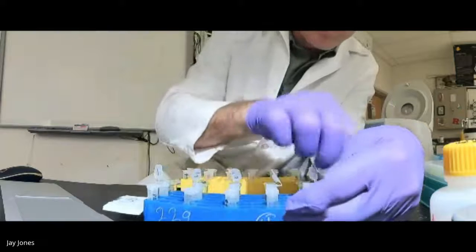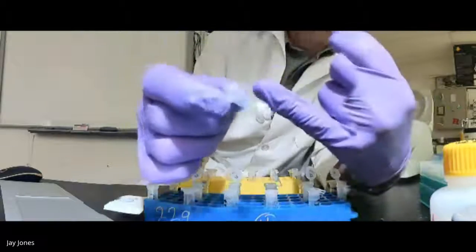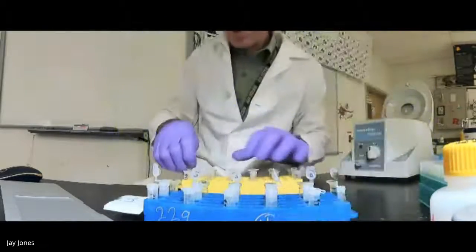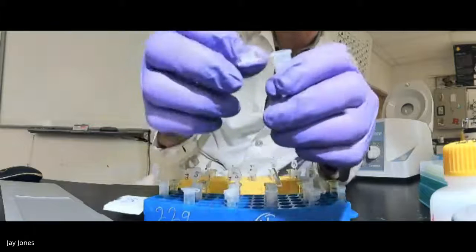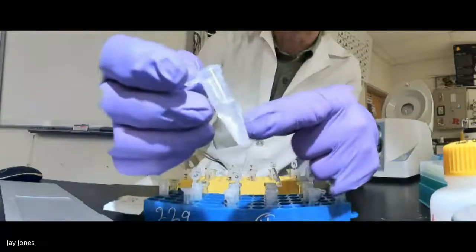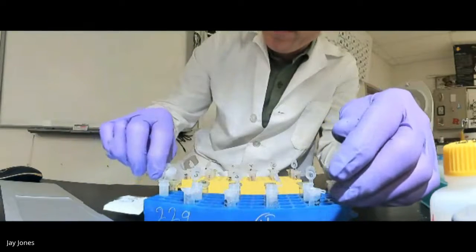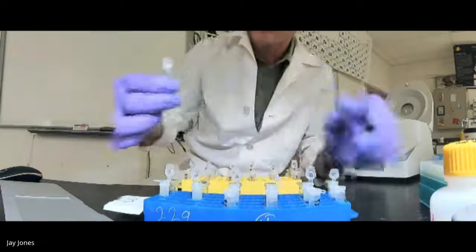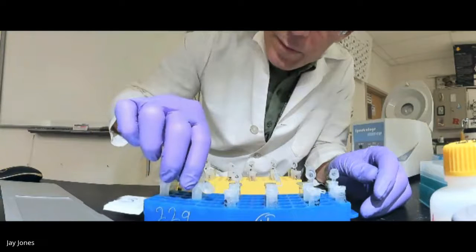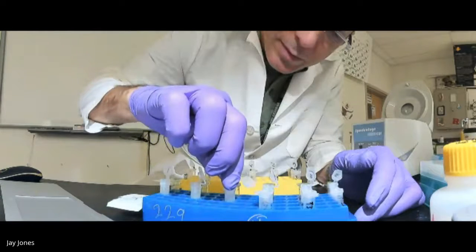I'm going to open up all of them. If you notice, they're nestled in a little collection tube. This is going to be junk, and this is going to be the gold. We want the columns. I'm going to open up period 12s as well. Then one by one, we take your precipitate and not use that. We want the other liquid called the supernatant, and we're going to pour those in. See, I'm pouring everything except for the white stuff. I don't want the white stuff. I'm pouring all of the supernatant, all of the liquid, and not the white stuff.